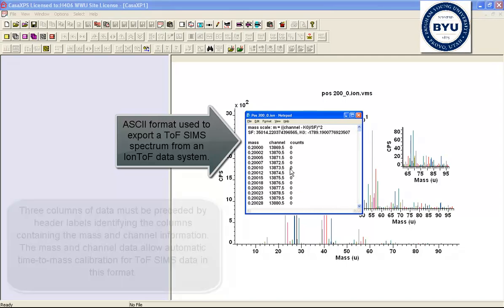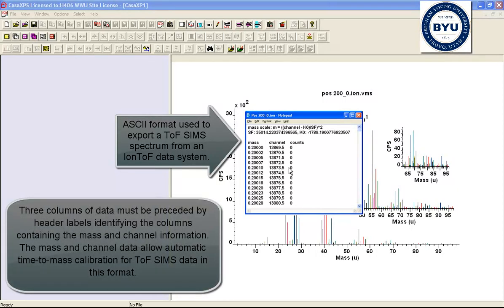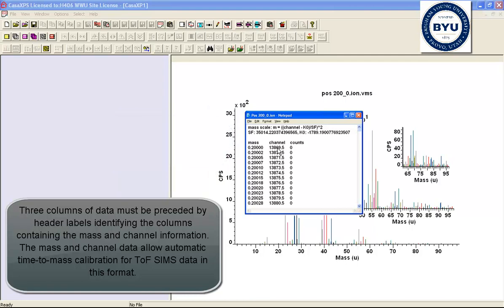ToF-SIMS data can be converted from ASCII files containing three columns of information. The first two columns should contain mass and the channel number associated with the mass, and the third column must be the counts in each one of these channels.